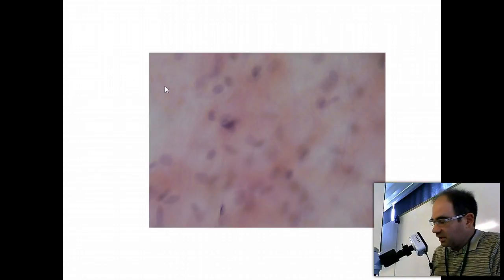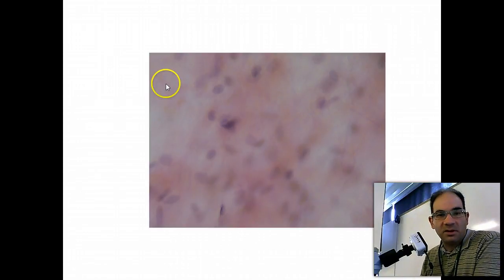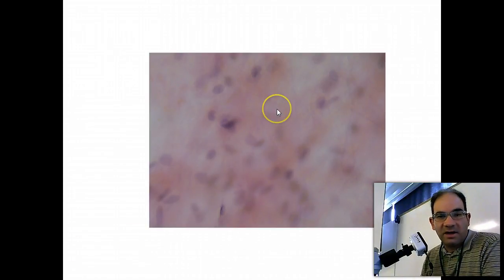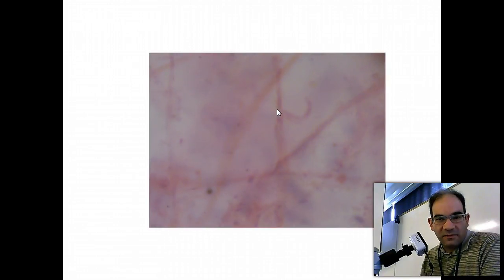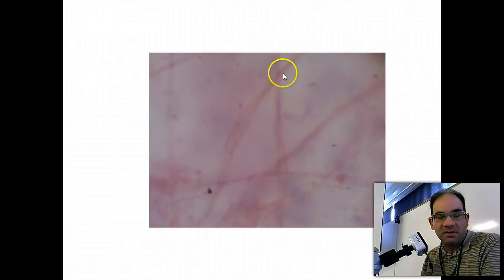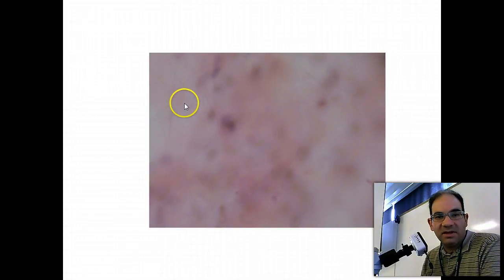So what I've got on the microscope is some areolar connective tissue at 400x, and our first fiber that we need is collagen fibers. If I tweak my fine adjustment, you can see these thicker, non-wavy fibers coming into focus. These are the collagen fibers. If I tweak my fine adjustment a little bit more, I've got some real fine fibers that are more wavy and branching. These are the elastic fibers.